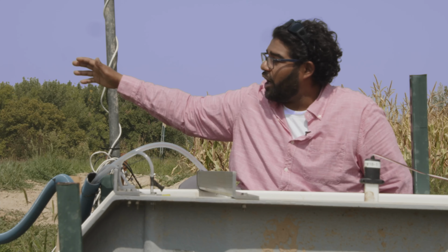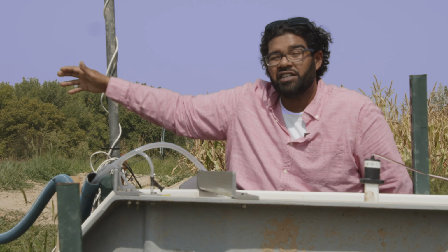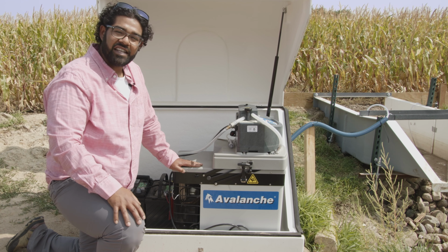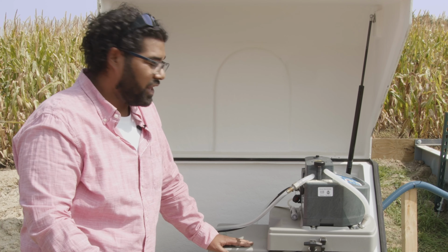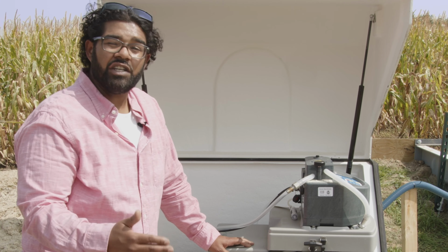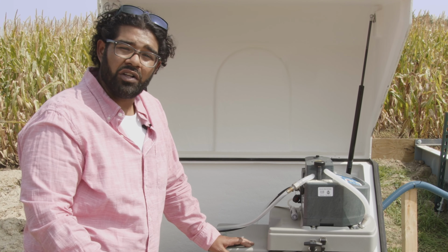This is also attached to our low-cost water sampler and our industry standards, so we could essentially do a side-by-side test, allowing us to capture a runoff at the same time, at the same volume, and then we could do a side-by-side comparison test. This system is attached to our industry standard, our Teledyne Avalanche. This is a Teledyne Avalanche water sampler. This is a refrigerated model that essentially is considered the industry standard for edge-of-field water quality monitoring.